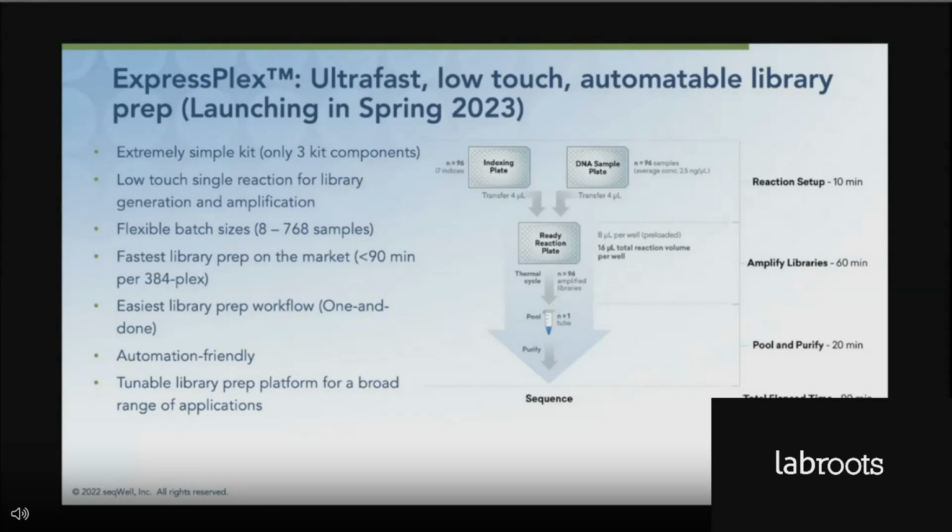And so with that, I'm going to turn this over to our collaborators, Henry. Henry Chan is the synthetic biology lead at Octant, and Bryan Jiang is the synthetic biology research associate. They're going to tell us today about their work in deploying ExpressPlex as part of the OCTOPUS protocol, which they have developed to support high-scale, high-throughput plasmid sequencing. Henry and Bryan, it's all yours.